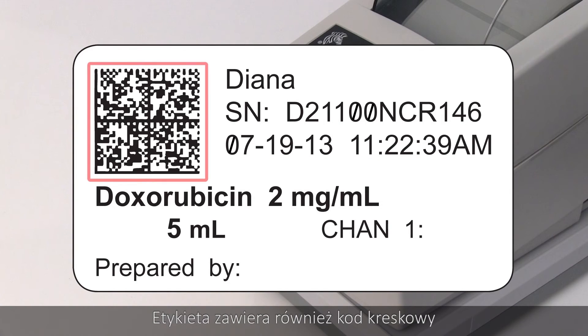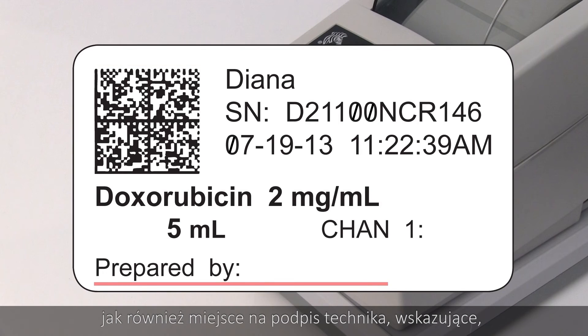The label will also contain a barcode that corresponds to the patient order number that was scanned at the beginning of the process, as well as a place for the technician to sign indicating that the mix has been completed as ordered.